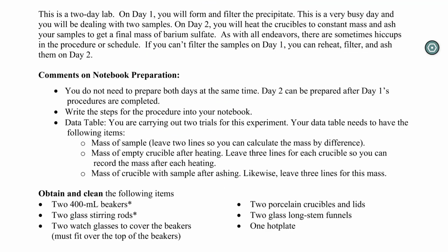This is actually a 2-day lab. It takes about 1 day to form and filter the precipitate from the solution. It's pretty busy because you're going to be dealing with 2 samples at the same time. Make sure you watch the videos on how to do some of the different parts. It should help you work a little bit more efficiently.